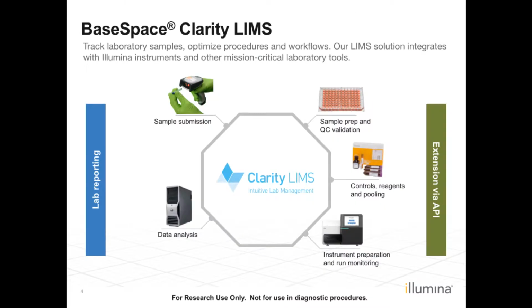In LIMS, we track laboratory samples from the time the sample is submitted through the QC and sample preparation, while keeping track of controls and reagents used, as well as what pools you create. We also have out-of-the-box integration to many next-generation sequencers, allowing you to set up a run and monitor those runs when they're completed. Those core components of Clarity LIMS can be supplemented by our lab reporting module, as well as extension of the system via our API. We'll talk more specifically about both of those later.